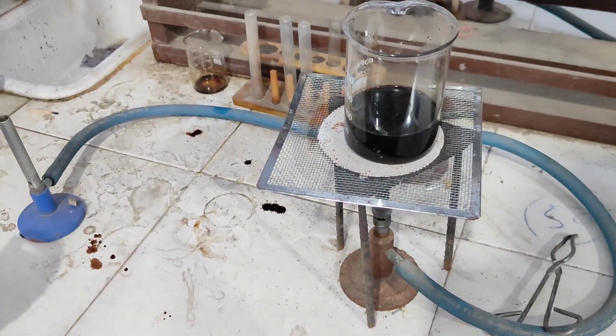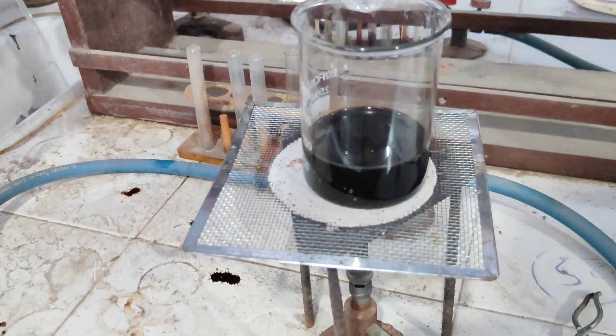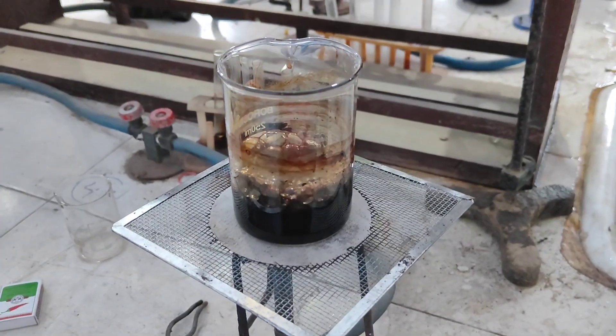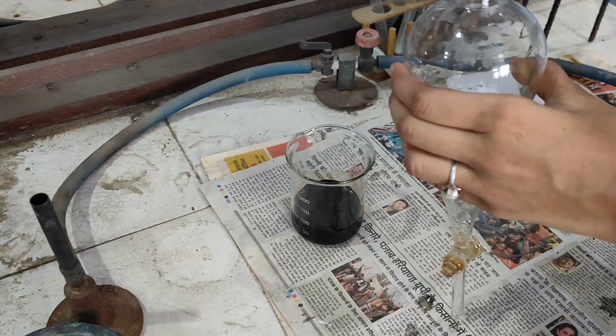After we filter the solution, we put it on heating again to reduce it to half of the volume. We see the solution has reduced, and after it cools down we proceed to the next step.